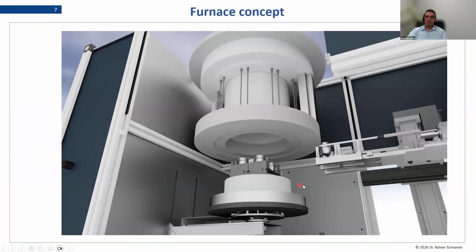Let's talk a bit about the furnace design. So like you see here, the furnace is round. We have the fusion room protected by a tube so that the heating elements are behind that tube and can never be spilled by the sample and flux. We have here this round bottom, which with a lift is just going into it. And here you can see also that the crucibles are of course not in the center. So the more force we integrate, the better you can homogenize the sample and flux in your crucible.